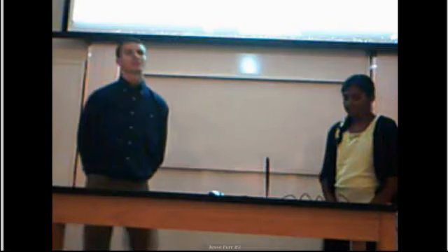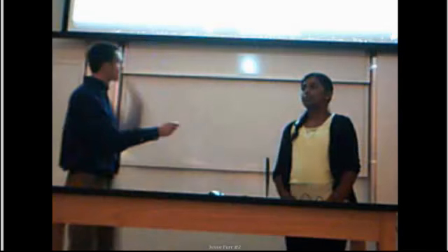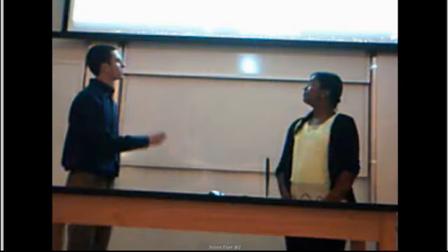And so the next step is thin layer chromatography, in which we take a silica TLC plate, as shown above, and we use capillary tubes, which collect 1 drop of our reaction mixture. We put 1 drop of our reaction mixture on the plate, as you can see, and 1 drop of 9A standard, and another drop of 6-MP standard.